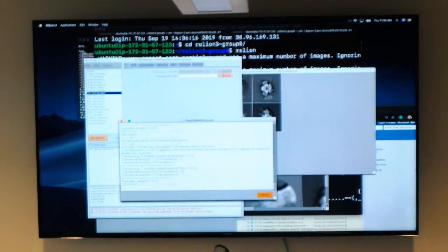It plateaus. And once you plateau, that potentially could be sufficient to stop. So even though the default is 25 iterations, you might be done in 10. You might need 100, depending on what your data set actually looks like.